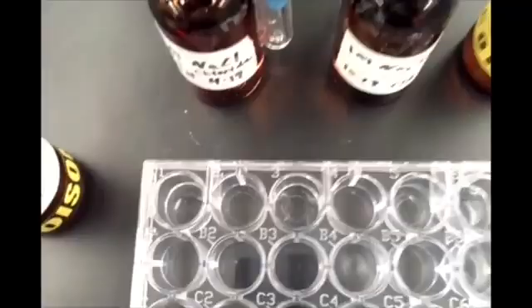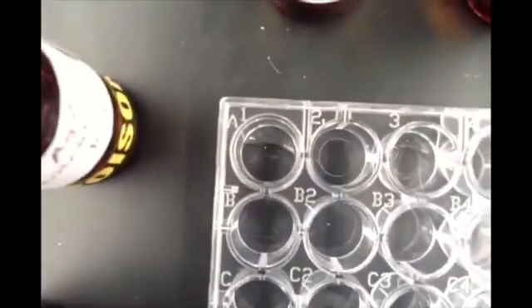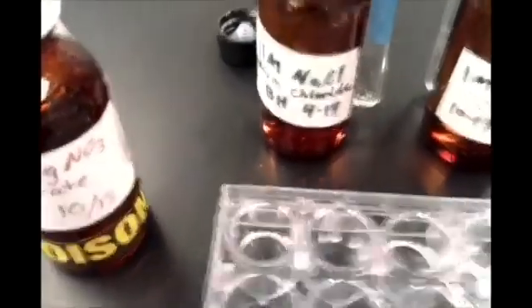Alright, first up we have silver nitrate and sodium chloride. So I've added a couple of drops of silver nitrate to this first cell over here. So remember, silver nitrate is AgNO3. Oops, that's going to show up very well there. There we go. And we'll now add our sodium chloride to that, so I'll get a few drops of that.